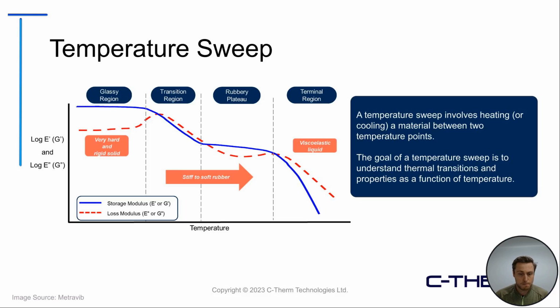And you'll often pick these two temperature points that are related to your operating temperatures plus a little bit more to get a full picture. And sometimes you'll push your material to the extremes to really understand what's happening here and to get a clear view of your material. The nice thing, again, with a high force DMA is that you can clearly measure the glassy region, which is often too stiff for some low force DMAs.